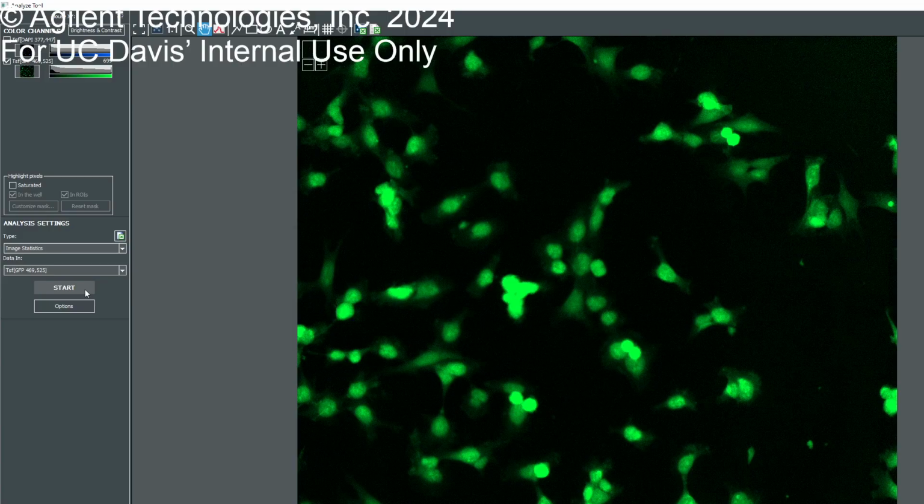Yeah, we can use the DAPI for cell counts. If you're looking for cell count, this is going to give you wonky results, right? Because it doesn't really distinguish between the cell boundaries there. So we're going to use that for the cell counts.